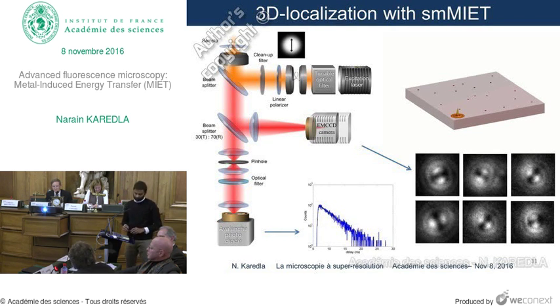Okay. And associated to that is the fact that you always presented your biological structure, for example, the measurement on the membrane or maybe this DNA molecule that you attach to the surface, as almost immobile. I would expect that the membrane is not immobile, it fluctuates. Since the amplitude of the distances that you can resolve are tiny, like this beautiful 4 nanometer or 5 nanometer, I don't know how much the amplitude of this fluctuation would be, but I'd be surprised if it were much smaller than this. So how do you take that into account?